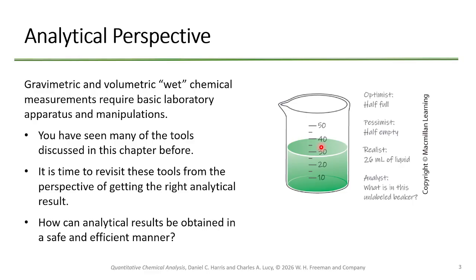The analytical balance, much more expensive. We'll use that sometimes. That one's much more accurate. Okay. And much more, well, ours is much more precise. May not be more accurate because I need to calibrate that. But okay. And so you've seen most of these tools before now. We're just going to get this analytical mindset.